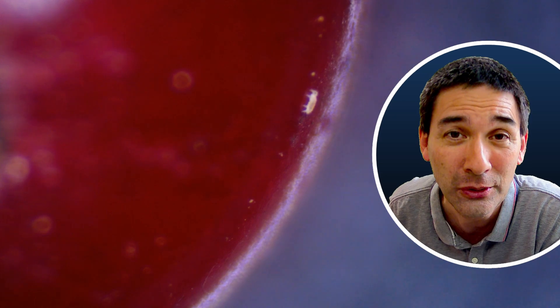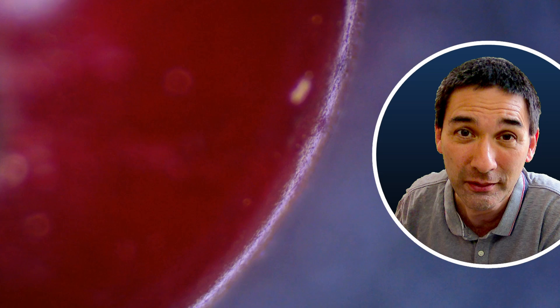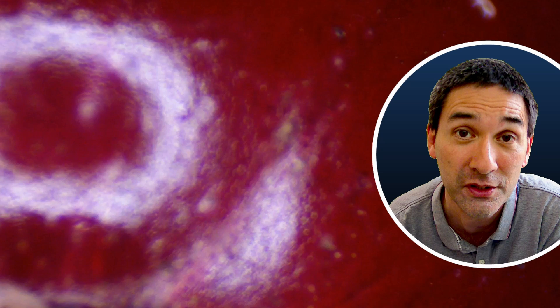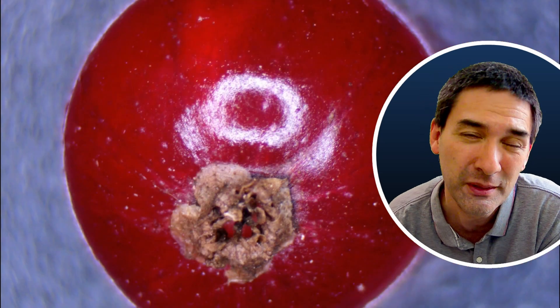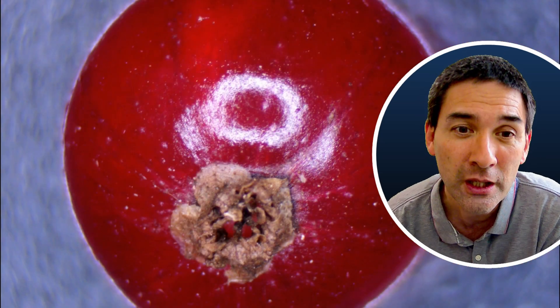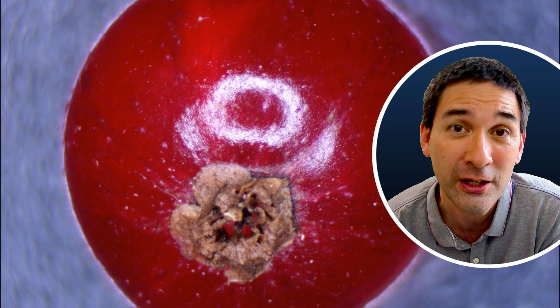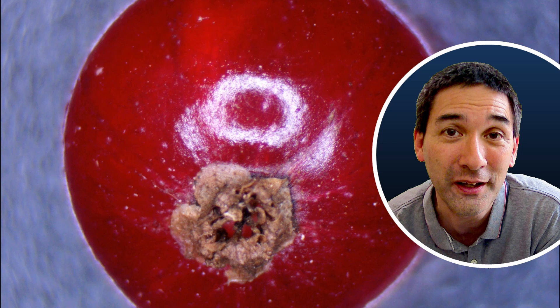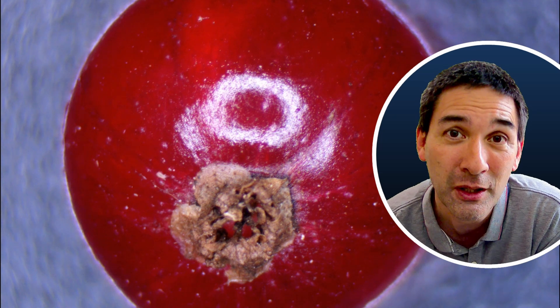This was quite difficult to do. How do you actually pick them up, and how do you put them on a microscope slide? I'll explain this later on. Those mites — I could see there were several different kinds, with different shapes. Of course, different sizes too; they could have been of different ages, but in a natural environment we should not be surprised to find different species living on those berries.